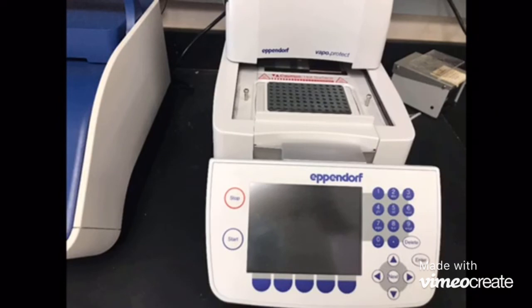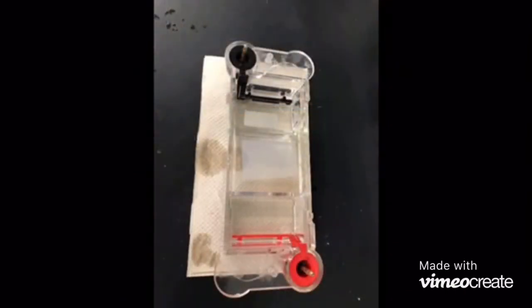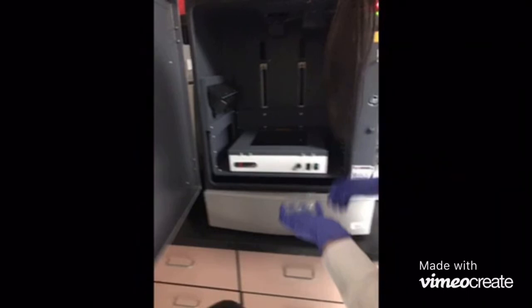What we mainly use for this technique is called a PCR technique that allows us to break down the DNA and copy it many times over and over. We then create a gel called agarose gel, which once it solidifies, we put it into a container with a TAE solution. Then we put it to a voltage. The solution will run to a positive charge. Then after that, we put it in a machine that takes and it will show us a result, whether it is knockout or wild type.